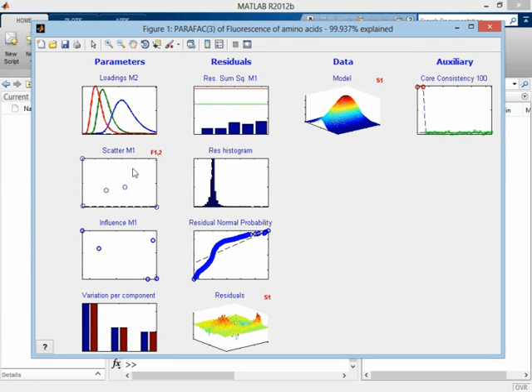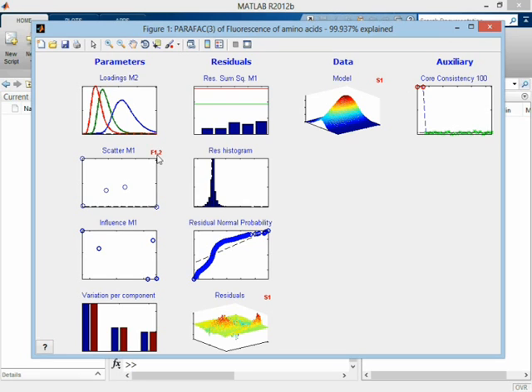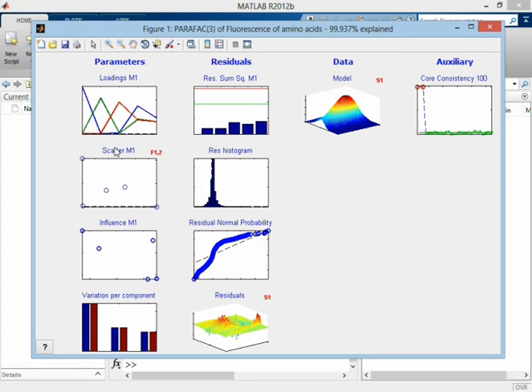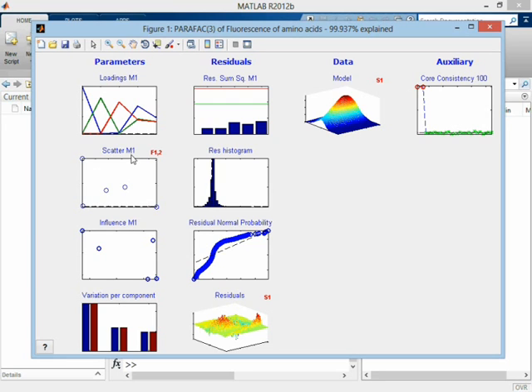Okay, here we have more or less the same thing. It's just a scatter plot. And it says F1.2. Well, that's because it's a scatter plot of factor 1 and 2 in mode 1. So it is the green versus the blue one. Just an ordinary scatter plot. In this case, a score plot of score 1 versus score 2.